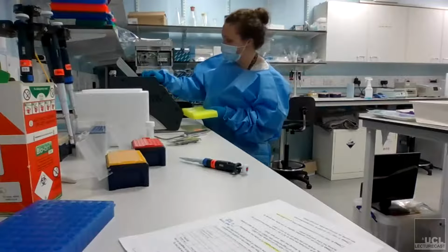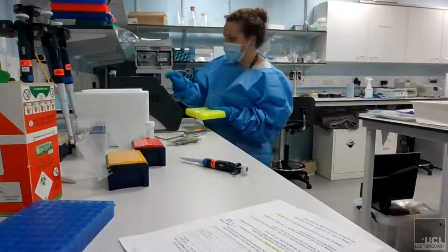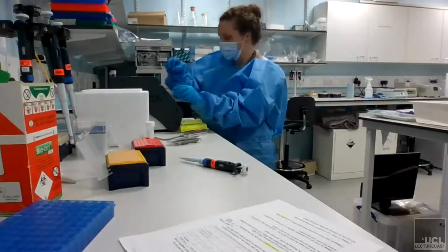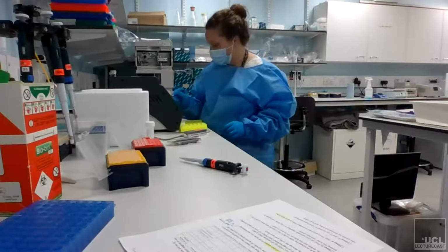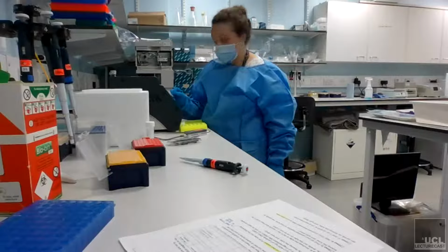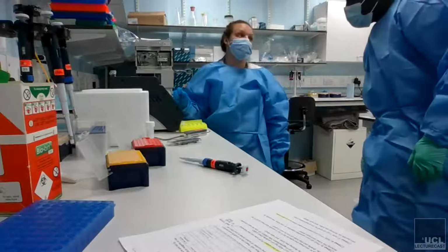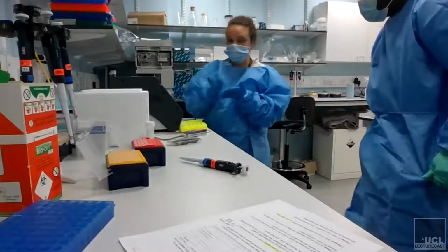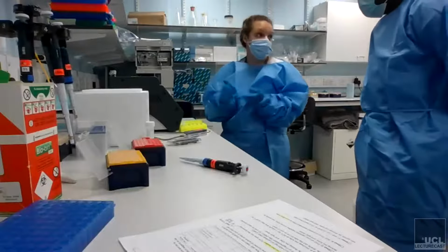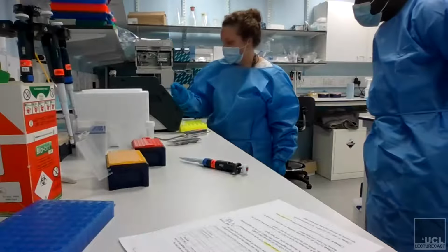Obviously making sure the sample is down at the bottom of the tube. So I will program this. Start. Okay, for your benefit, as you might be using this, the program is called MinION tagmentation, because what we're doing is tagging the barcode to the DNA. But I can show you how to use this properly.